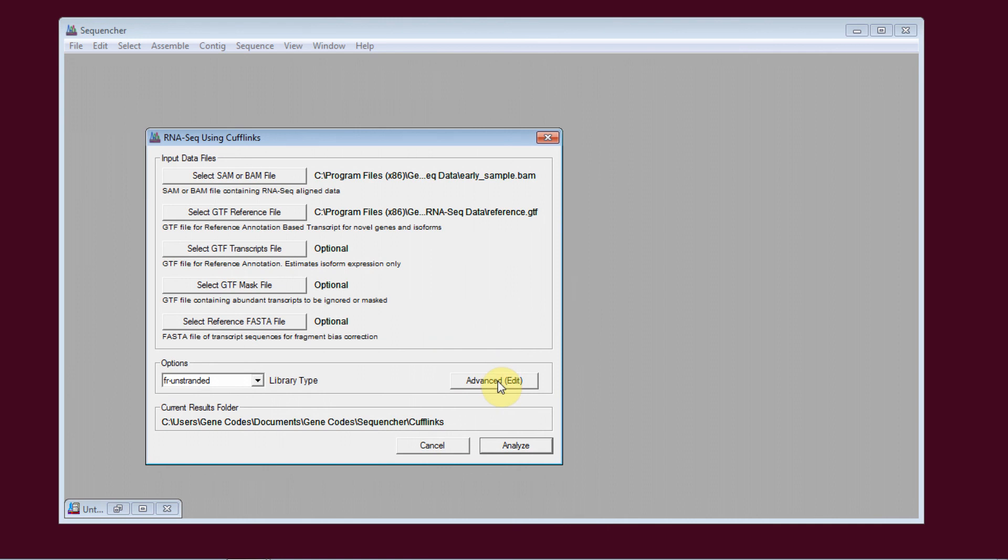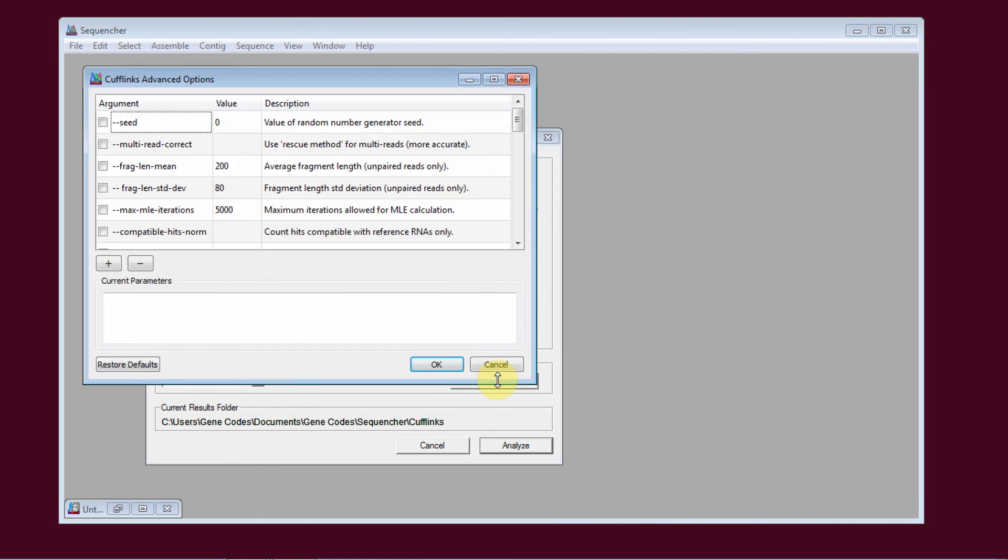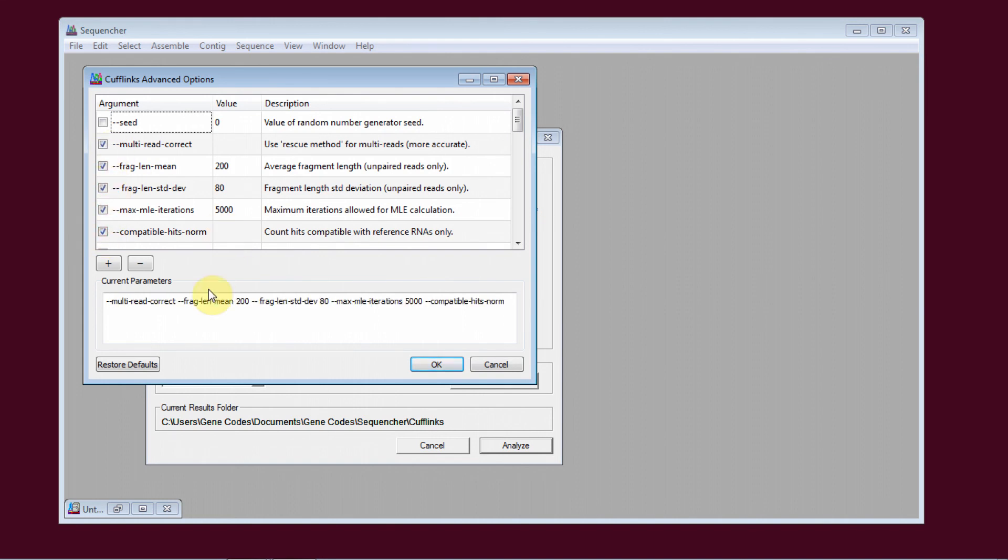If you click on the Advanced button, you have all sorts of advanced parameters that you can select here. You turn them on and off. These are the command-line arguments that you would have to type out exactly if you were running this without our interface.